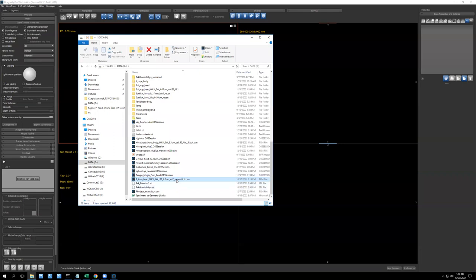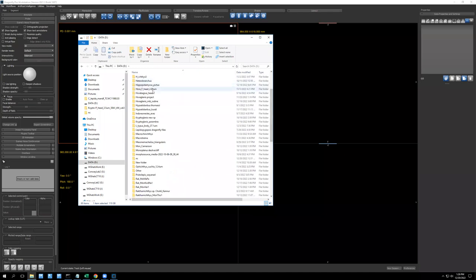You have a stitch if you have multiple segments. The kinds of files we can open are TIFF stacks, TXM files, which are reconstructed data, raw data, which we're not going to do, and ORS objects and ORS sessions. Those are the different kinds of files we can open.